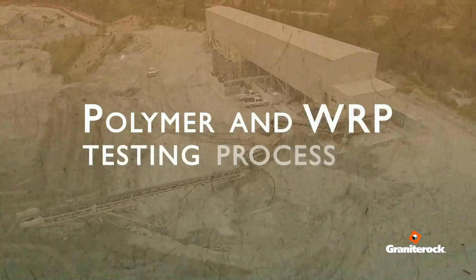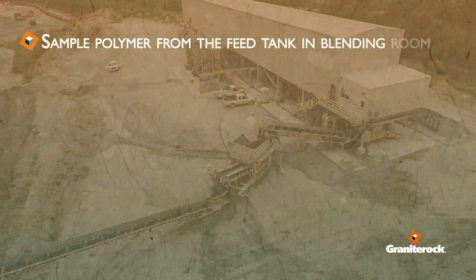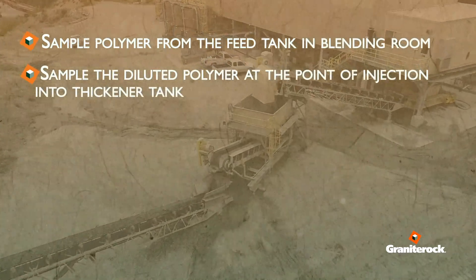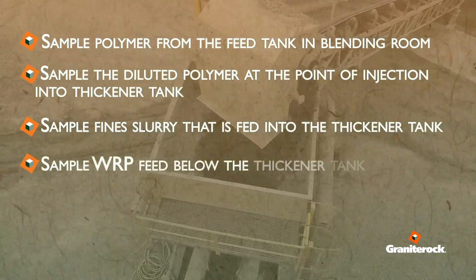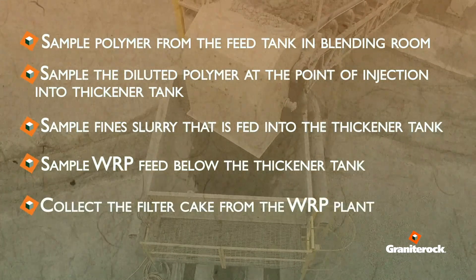Sample collection process: sample polymer from the feed tank in the blending room; sample the diluted polymer at the point of injection into the thickener tank; sample fine slurry that is fed into the thickener tank; sample WRP feed below the thickener tank; and collect filter cake from the WRP plant.